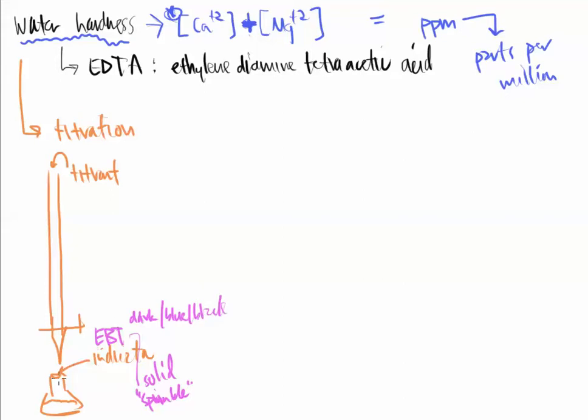And when we put it into the water sample, my water sample will turn a reddish pinkish color down here below. That's the color that this thing will go to in the very beginning. Okay, so what are the directions?